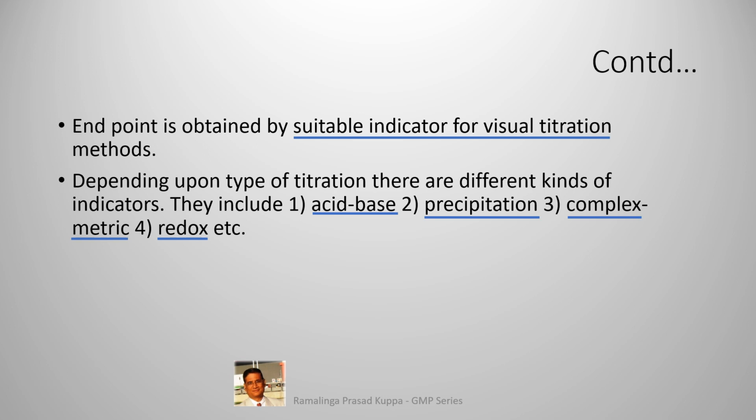In acid-base titrations, pH sensitive indicators are used. These indicators have different colors at different pH levels. The change in color is also very sharp and easily identified. Typical indicators are methyl red, which changes from red to yellow when the pH jumps over a sharp range of 4.2 to 6.3, and phenolphthalein, which changes from colorless to pink at pH between 8.3 and 10.